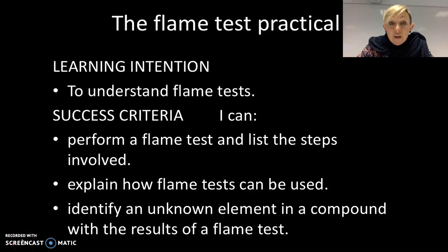Hi Year 10. Today you will be doing the flame test practical. The objective of today is for you to develop the skill of identifying unknown compounds by the colour that they emit when you heat them in a Bunsen burner.